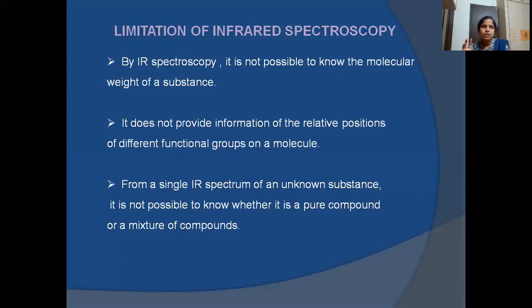You have to keep that in mind, because many questions can be asked based on force constant and mass, as well as how the vibrational frequency changes when there is hydrogen bonding. When hydrogen bonding is present, the vibrational frequencies will decrease. And then the other factors, the inductive effect and mesomeric effect. Why do amides show lower vibrational frequencies for the carbonyl group? Because the lone pair electrons on the nitrogen participate in conjugation. All these points you have to remember, and they are very important for interpreting IR spectra.